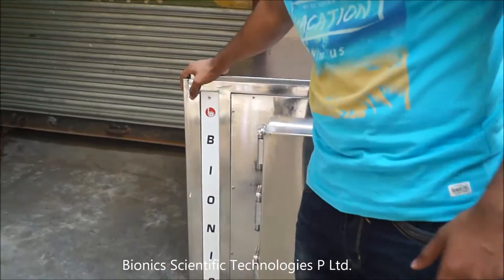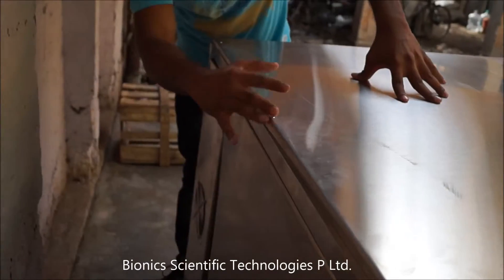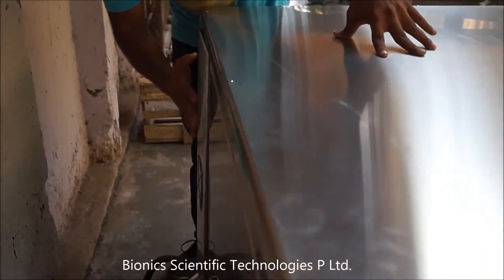The unit can be viewed from the front, left, right, up, and rear. It is completely made up of stainless steel at the back.